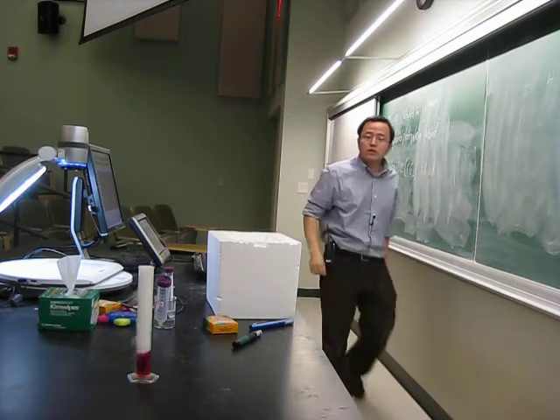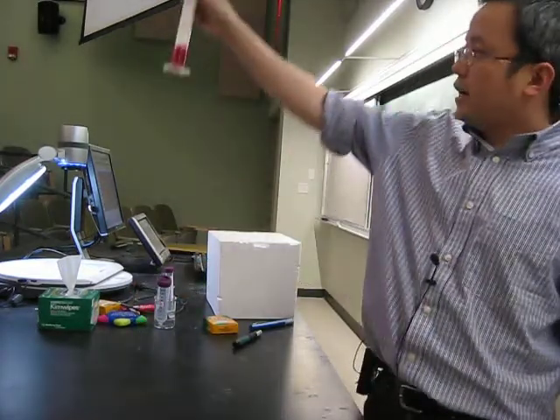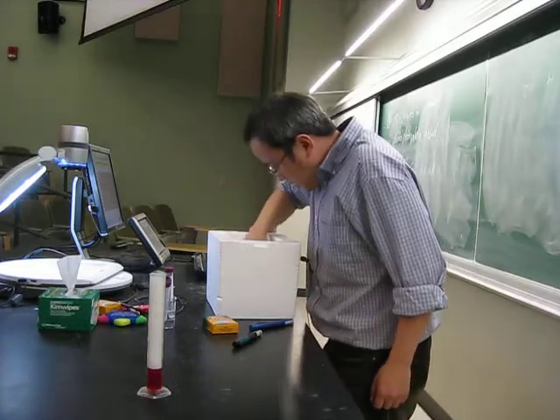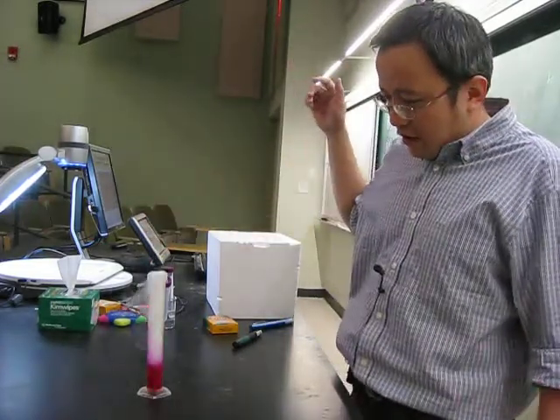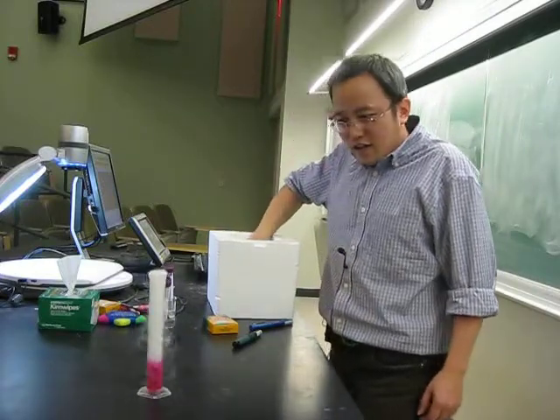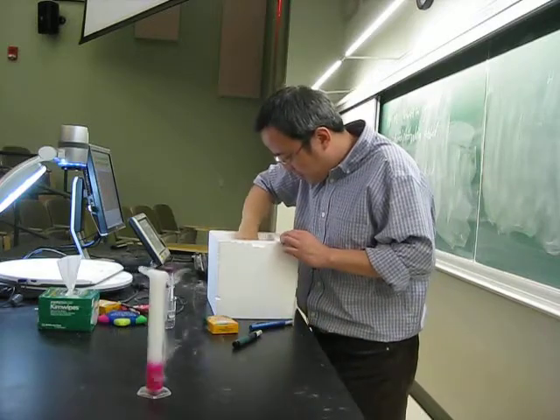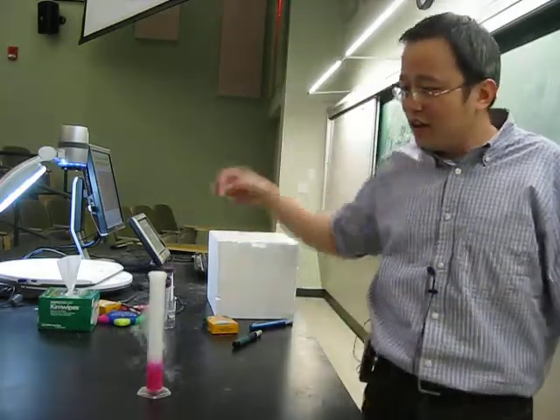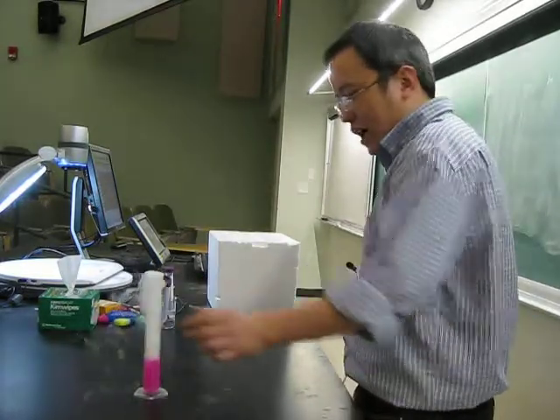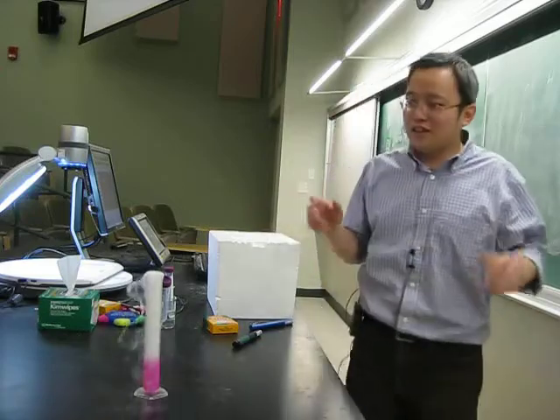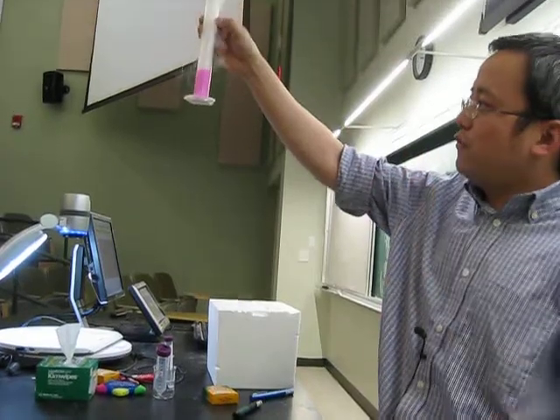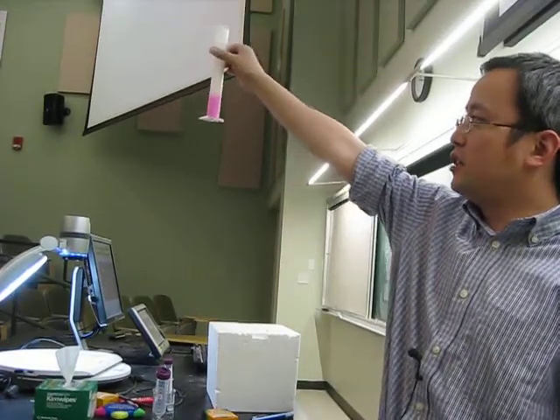Okay, and then you see bubbles. Okay, what is the color? Still red, but if you look at the intensity of red, it's not so impressive anymore. Okay, so let me keep adding. By the way, this demo, I didn't pre-run the demo because it looks like the reagents are precious. I asked the stock room to prepare that. I don't want to waste it just to pre-run the experiment. But I fully trust the people in the stock room. You see color changes, right?